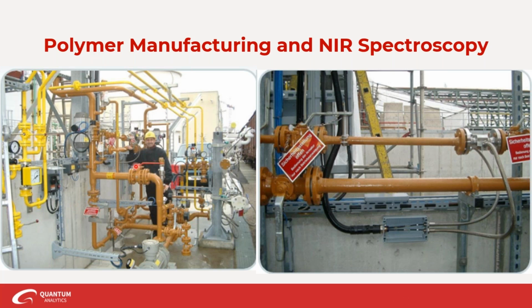And if it's not, then they'll turn it off and keep it from going into the tank and then eventually into the reactor. So where this guy is holding his hand here, as you see with my pointer, is this spot right here. So what's happening is the light is coming out of here, the sample's in this flow cell, it's passing through it and then going back through to the detector and identifying what the product is supposed to be and making sure that it's the correct thing and you don't send the wrong stuff into the tank.